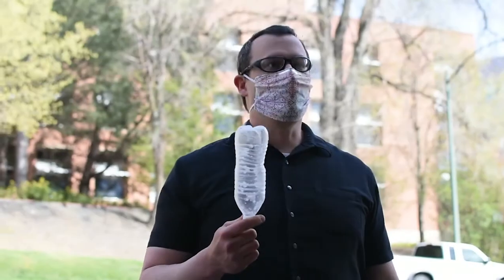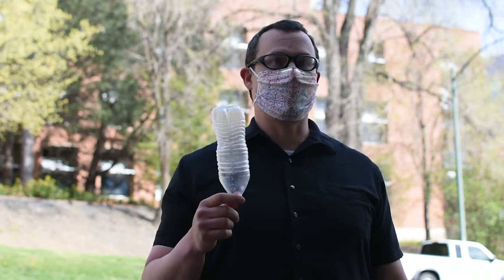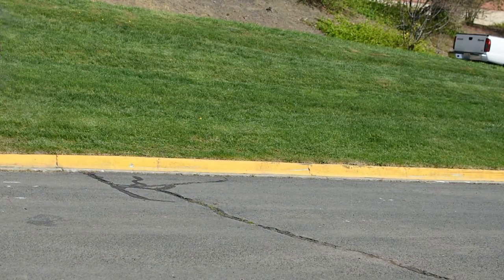If you get one that's too thick and you don't get it full enough of liquid nitrogen, you run into a very dangerous situation that you should not mess around with here in the lab. Because I don't want any calls saying we created a pipe bomb by accident in the lab and we don't know when it's going to go. Here we go. Don't hang on to it any longer than you need to. Okay.